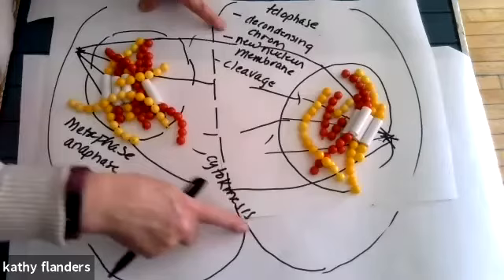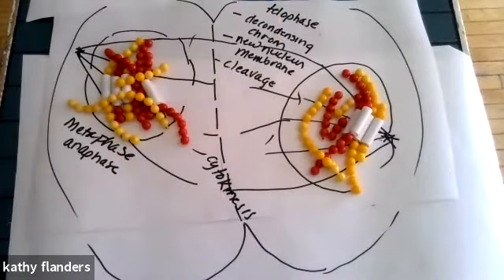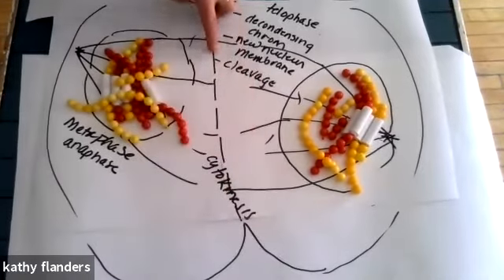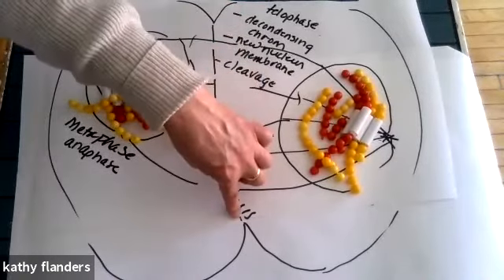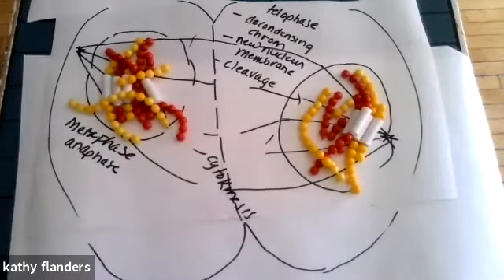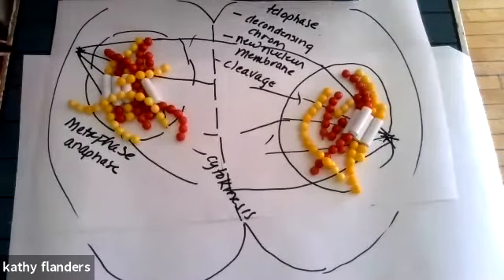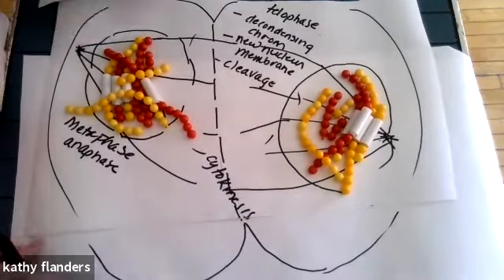Yep. That's when that dotted line that connects the two cleavages, is that the splitting? It is. It's the process of splitting the cells into two cells. So they separate the cytoplasm and they build more cell membrane along the middle of it. And that makes it two complete cells. So the next picture would be two individual cells.